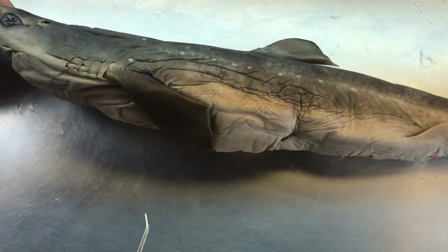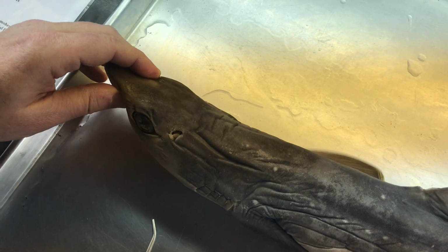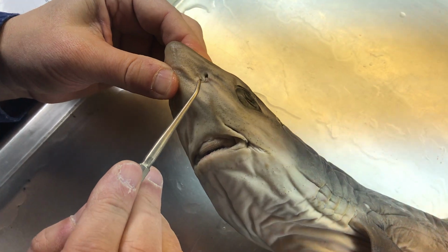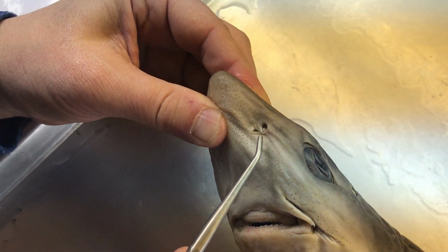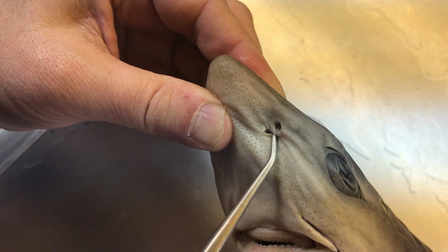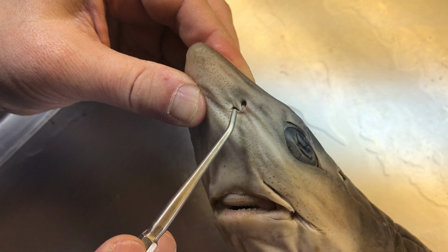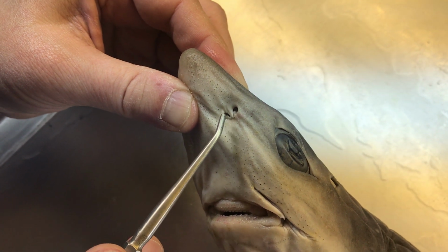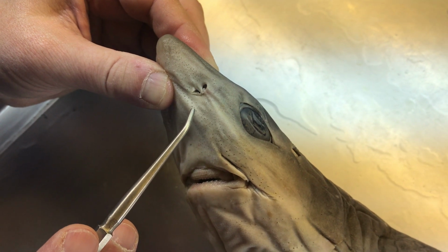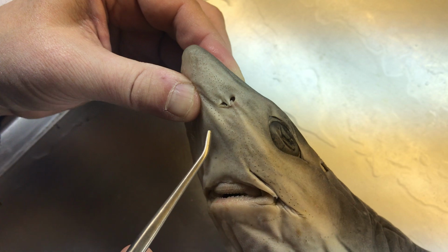So we will start with looking at features of the head. For the head, we'll begin with the nostrils. The nostrils have two openings. The outer opening is going to be the incurrent opening, where water flows in. The inner one's the excurrent opening, and they're separated by a nasal flap. The nostrils here only function in olfaction, not for respiration.